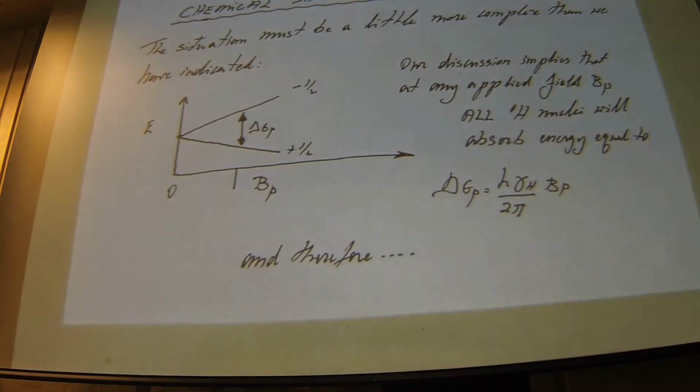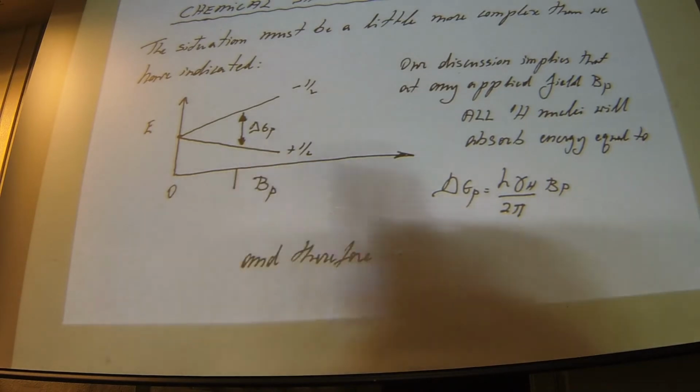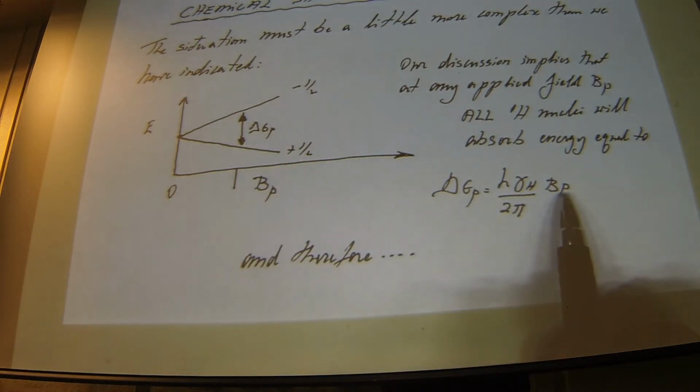Our discussion, however, so far would indicate that all protons, regardless, should have that same energy separation for a given field.